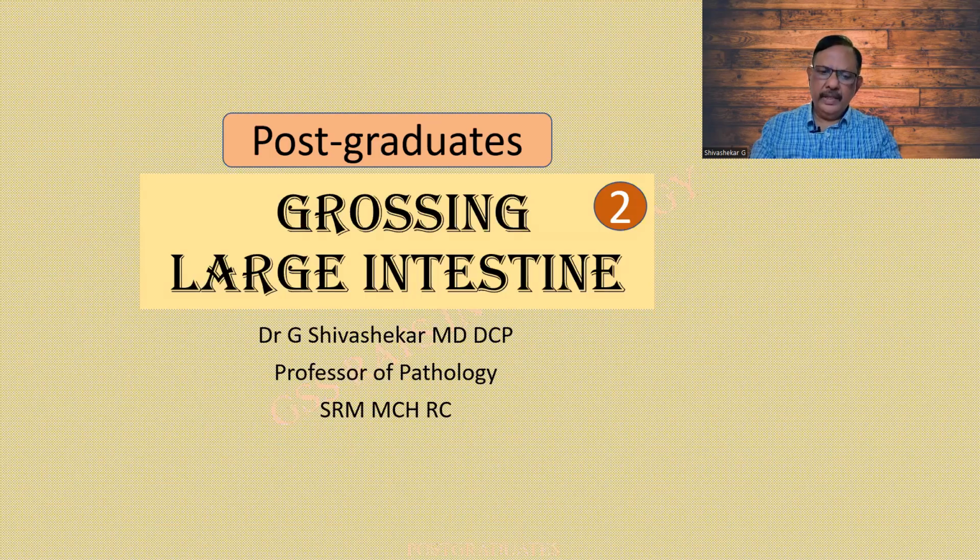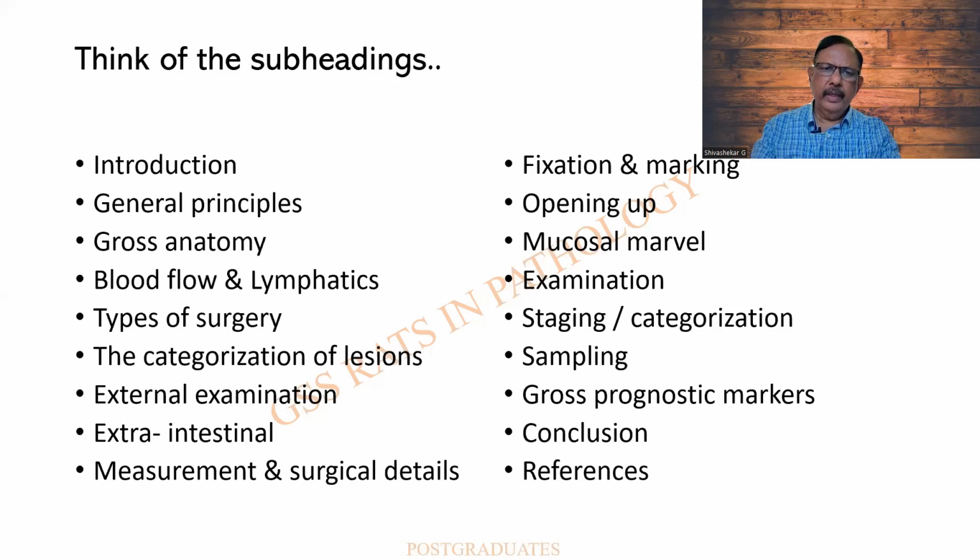Grossing of the large intestine, part 2. This shall be mostly confined to the tumor, particularly the malignancy. This I have already said, have it in mind.